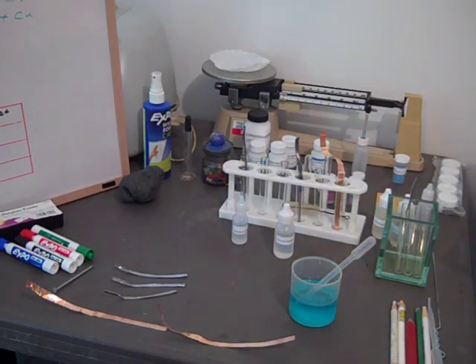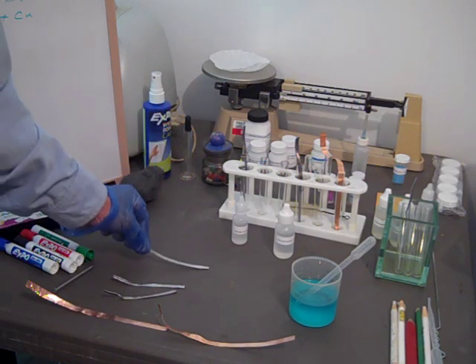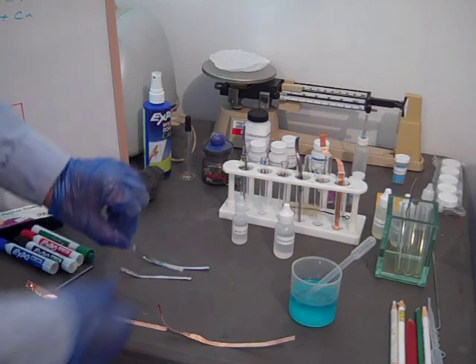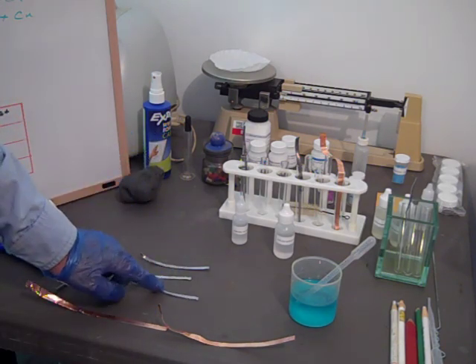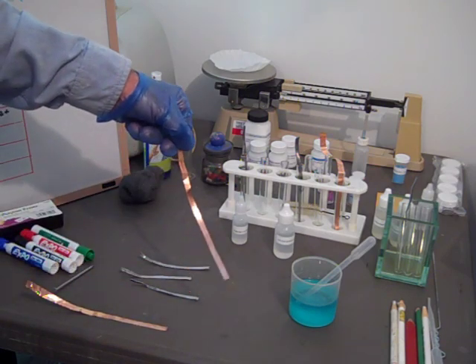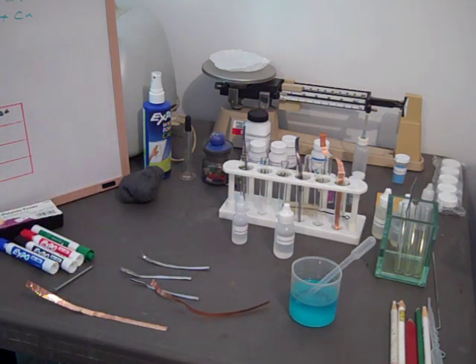We've already cut some strips of lead and polished them with the steel wool so that we can see if they react. And you see the lead, it's a very soft metal. We got that from roof flashing material. And the same way we got copper strips. And we polished that with steel wool to make sure that we could see any kind of reaction.